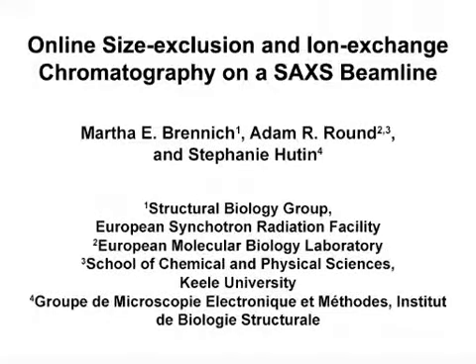The overall goal of implementing online size exclusion and ion exchange chromatography on small-angle X-ray scattering beamlines is to obtain better quality low-resolution model data by ensuring minimal delays between sample preparation and data acquisition. These methods can help to answer key questions in the field of structural biology, like the radius of gyration, the largest intraparticular distance, the particle shape, the degree of folding, denaturation or disorder.